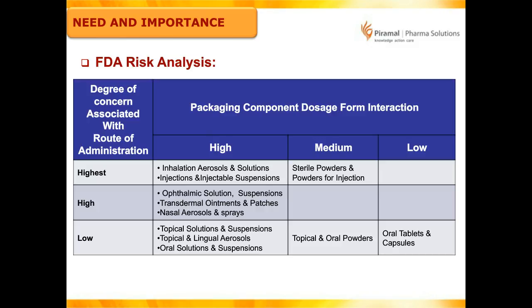But primarily for inhalation and injectable products, it is mandatory to have such a protocol well in advance once you have identified your packaging material. Before you go to the GMP site, my recommendation would be that we need to have an extractable leachable study along with the final packaging material which will go into the commercial site for the drug product. So that is my recommendation for the extractable leachable study.